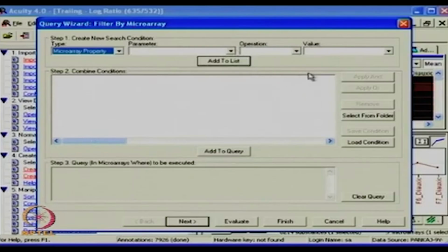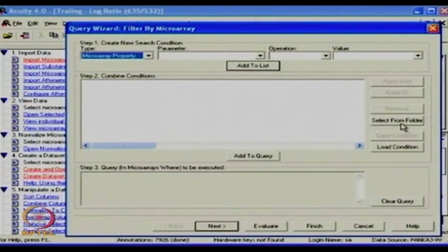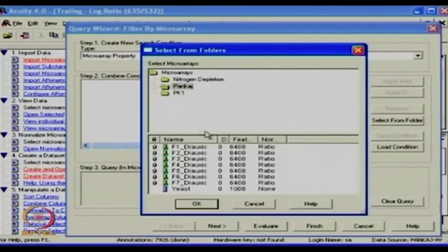This is a little tricky, because if you have the same name multiple times, the data will be imported twice. So you need to make sure your folder is right and that you have given only one copy. To avoid that, I can select a folder and say I am in this particular folder and I want to import all the data from it.